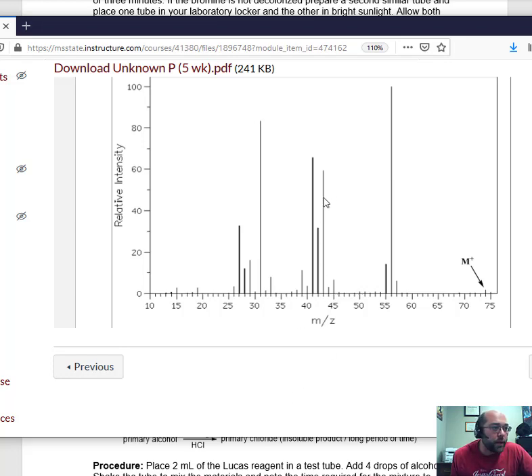So that would be 40, 1, 2, 3, 43. All right, I could look, well, what's that mass difference? Can I figure out what that is? If not, I have this other tall one as well. So I could go from 56 to now 41 and say, okay, well, what's left there? So this is kind of helping you a little bit with structure and with mass.